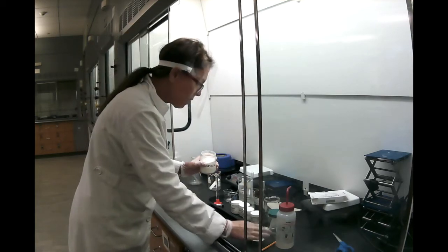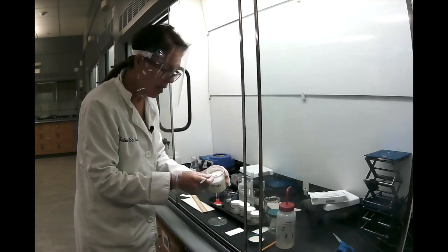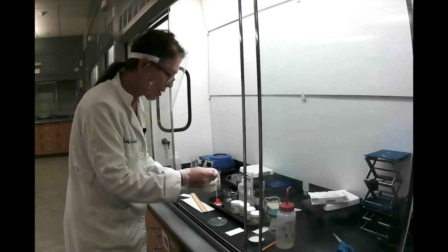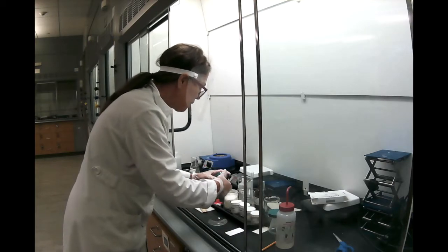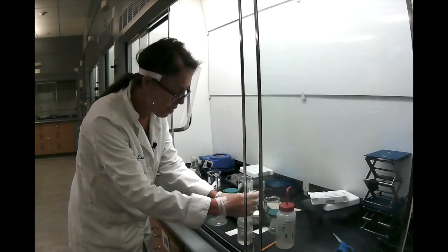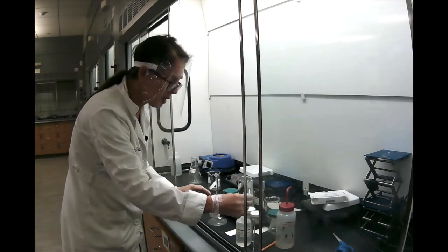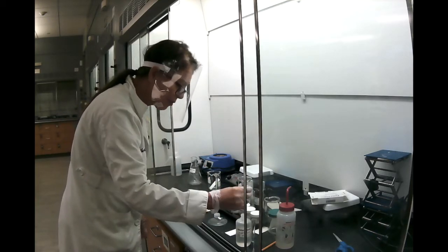All you need is basically the tip of a spatula, a tiny bit, about the amount of a grain of rice on the tip of your spatula. And then you add a few drops of ethanol to dissolve it. So here I have my ethanol, absolute ethanol, meaning it doesn't have water in it. Just put 3 drops, should be enough.